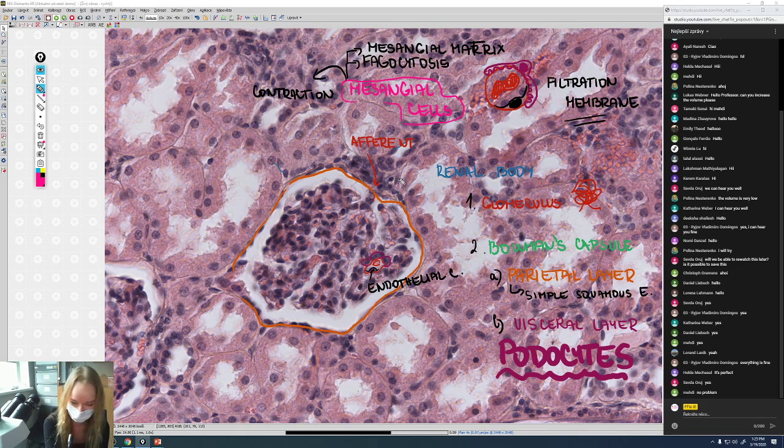So they are very much eosinophilic, and they don't have contact with capillaries. So probably this cell right here would be a mesangial cell, or this cell in the middle of nowhere, or this cell here with very eosinophilic cytoplasm. And here, well, these are the very pretty mesangial cells.